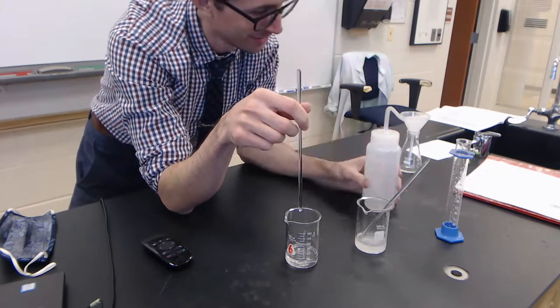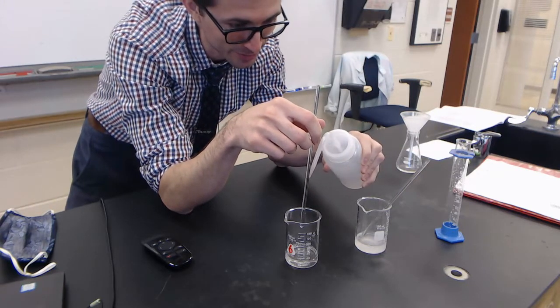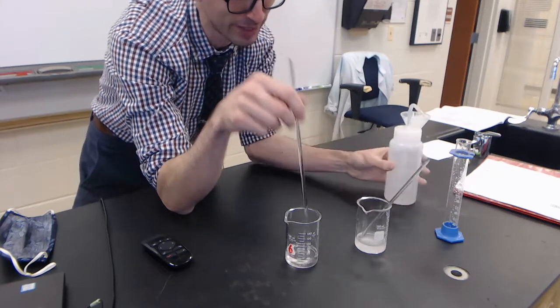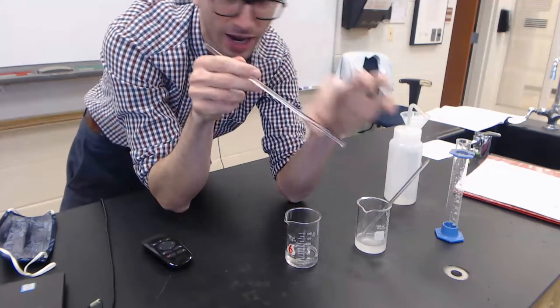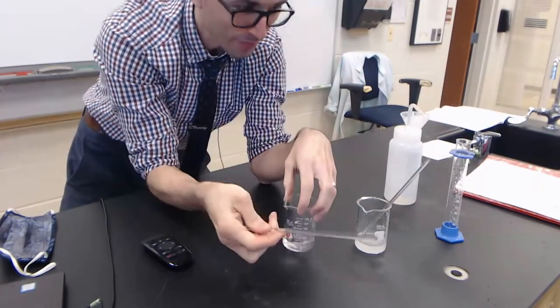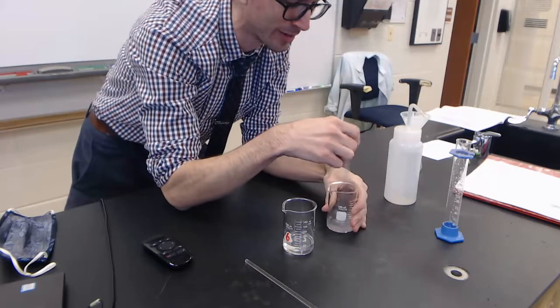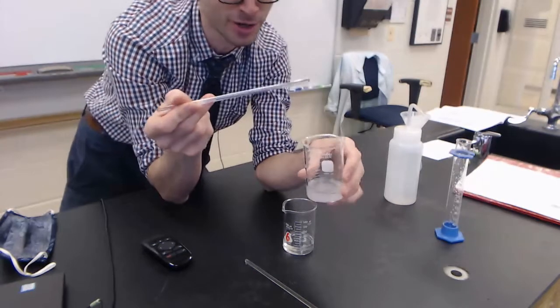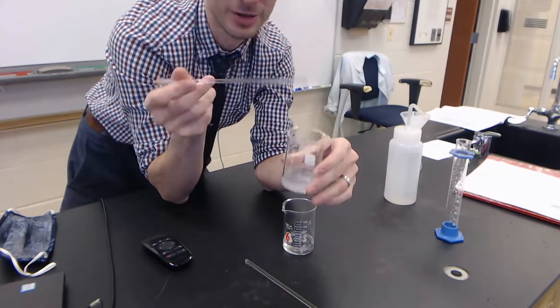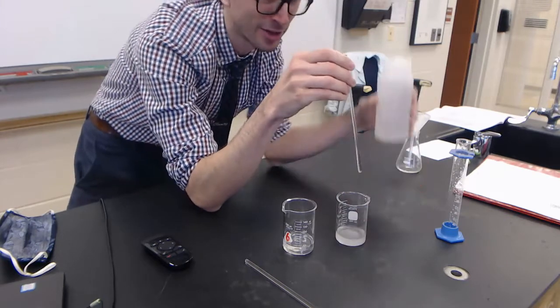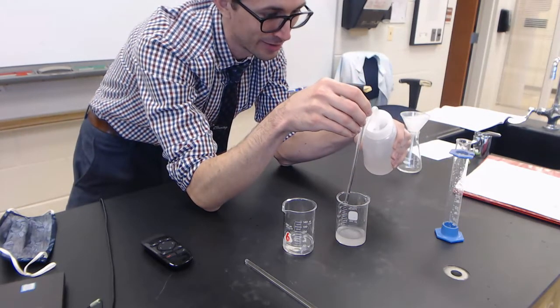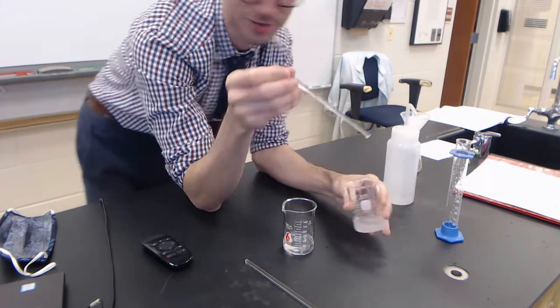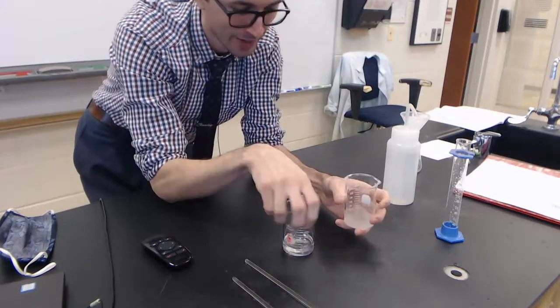What I like to do is squirt some of the distilled water down the stirring rod, and what that does is it makes all of those extra ions that were on the stirring rod now in my beaker. A lot of people think there's nothing on the stirring rod because it's clear and colorless, but there is. Just because something's clear and colorless doesn't mean that it's not there. The water doesn't screw anything up because I added water to it anyways.